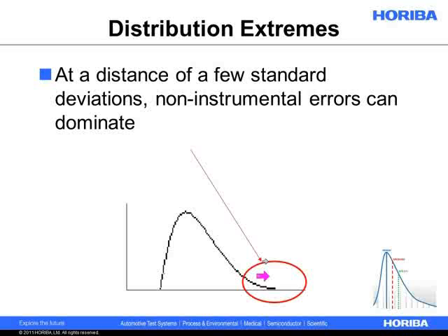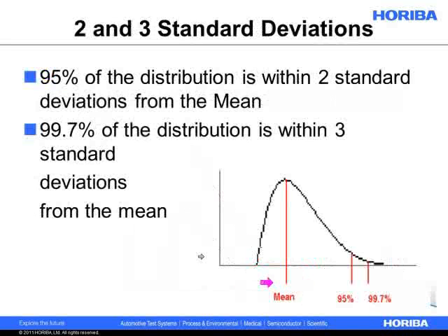It also means that there are very few levers we can push to improve the precision of these values. Really, measurement length is one of the only ones, which is very different than the body of the distribution. There's an awful lot of things we can do to help precision over here, very few things we can do over here. So again, when we're talking 2 or 3 standard deviations away from the mean, you're talking about so few particles it becomes very difficult.